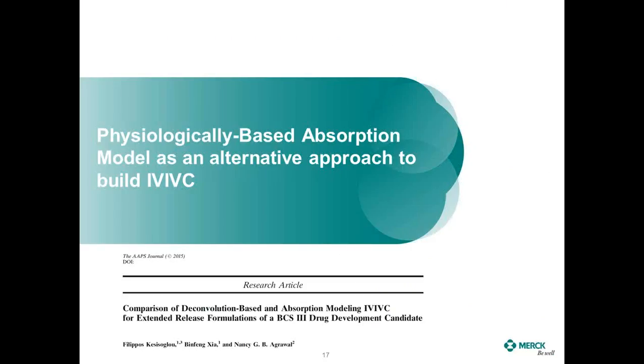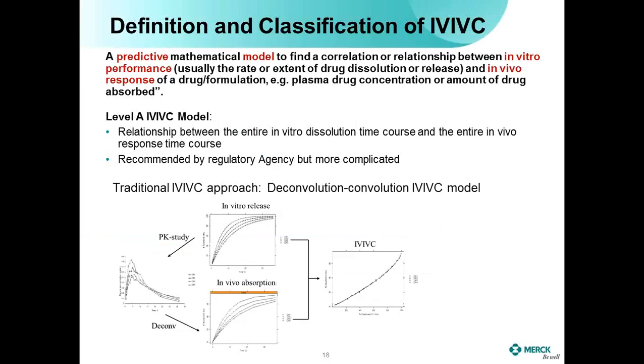So the first example is the physiologically-based absorption models as an alternative approach to build IVIVC. So the IVIVC here stands for the in vitro in vivo correlation. So this work has been already published recently in AAPS journal. And first let's define what is IVIVC.